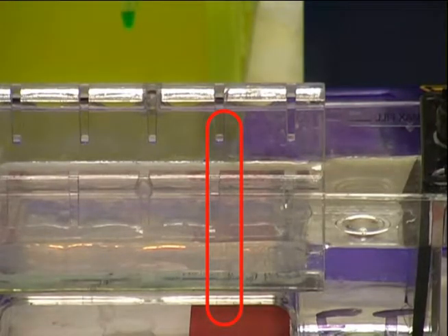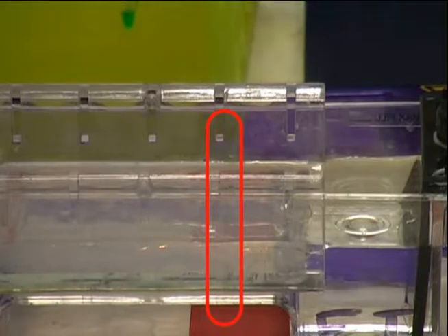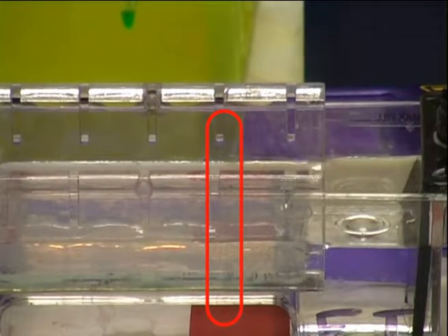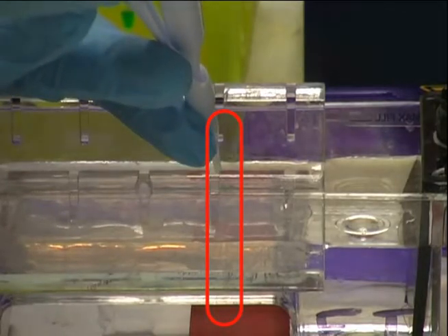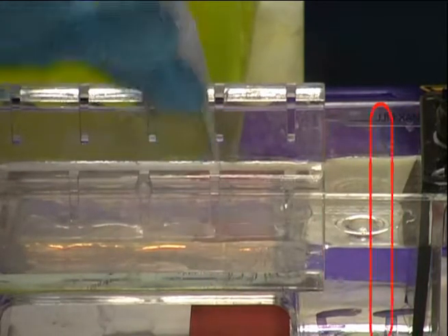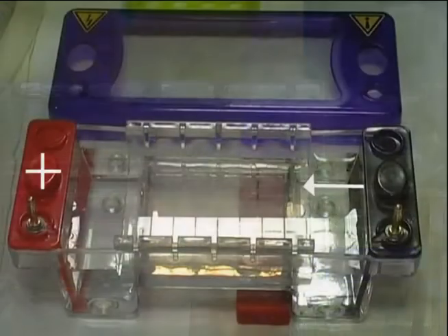Agarose is a long polysaccharide molecule that forms a semi-solid gel matrix used for separation of DNA according to size. DNA carries a negative charge, meaning that when exposed to an electrical field in the electrophoresis tank, it will migrate towards a positive terminal.